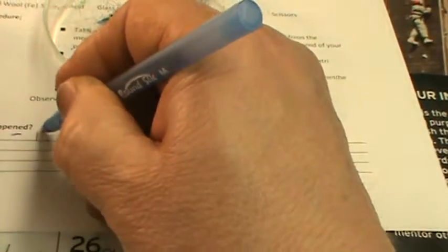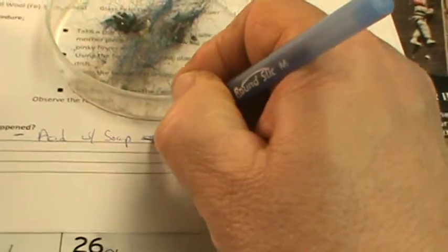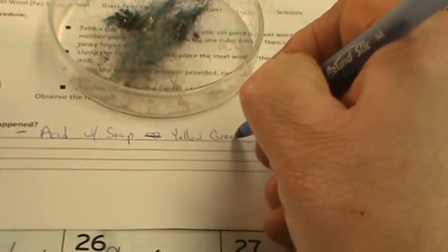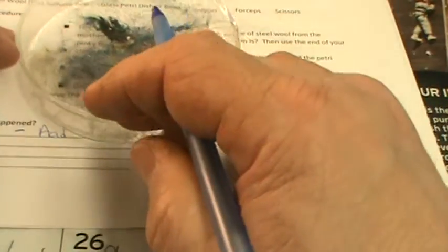This is the acid with soap, and we get a yellow-green reaction. As we can see, it's still continuing in there.